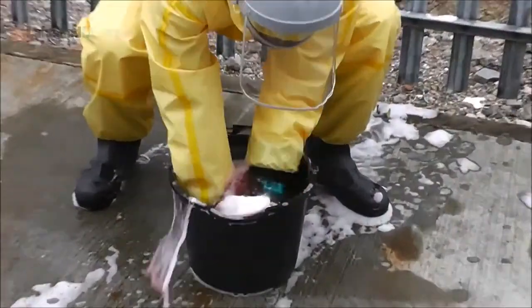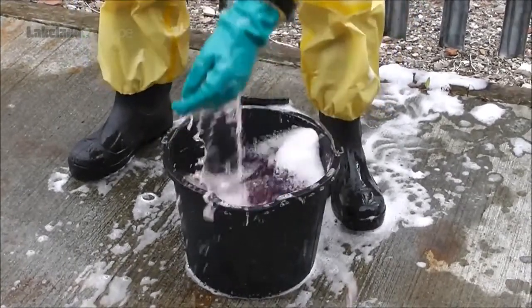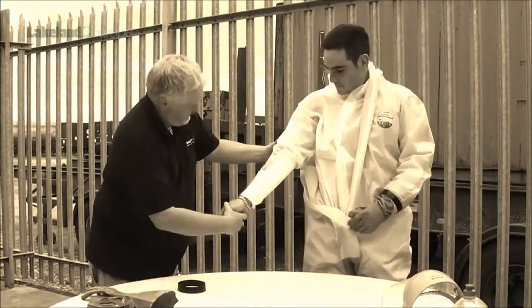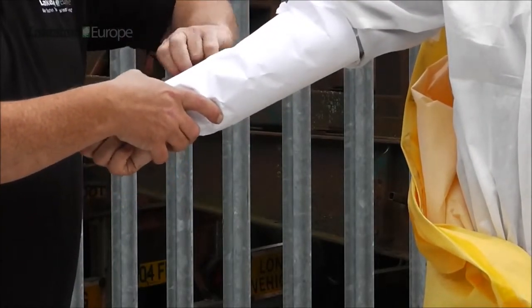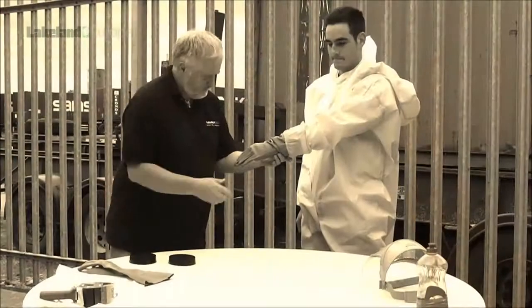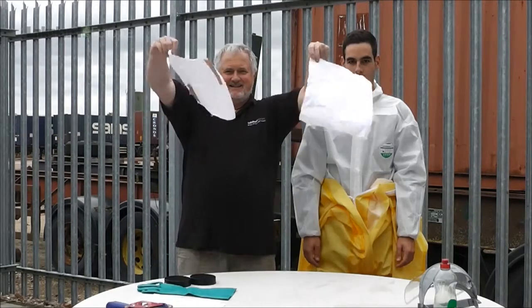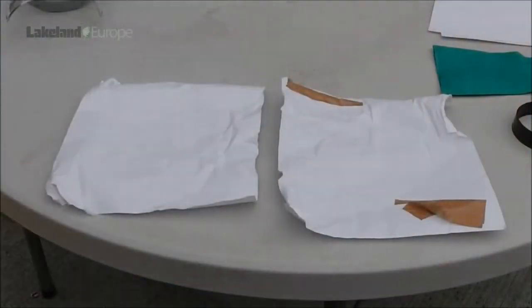The Lakeland push-fit glove system results in an effective seal between glove and sleeve. Would you be confident doing this using traditional adhesive tape? You can go back and see if there has been any penetration. No penetration at all. That's how effective the Lakeland push-fit glove system is. Even after Romain immersed his full arms into the water, there was not a drop of penetration.